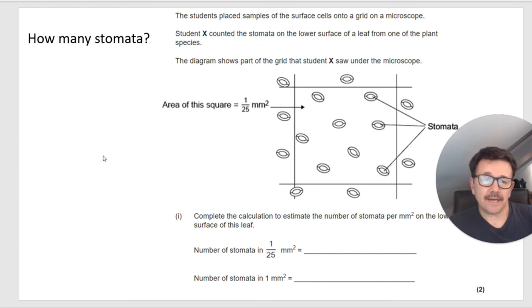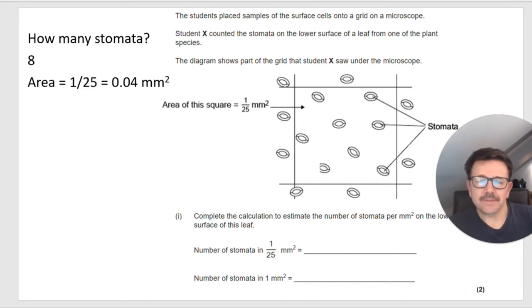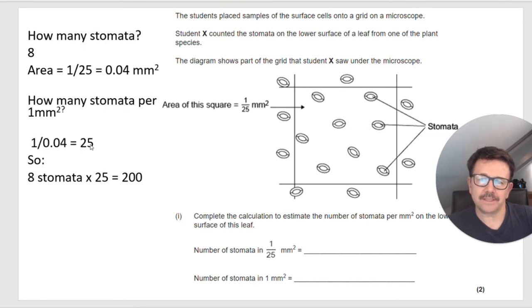So again, you count how many stomata. In this case, there are 8: 1, 2, 3, 4, 5, 6, 7, 8. Area, so it's 1 divided by 25, which is 0.04 millimeters squared. So you need to work out how many of those will fit into 1 millimeter squared. 1 divided by 0.04 gives you 25. So 8 stomata times 25 equals 200. There we go.